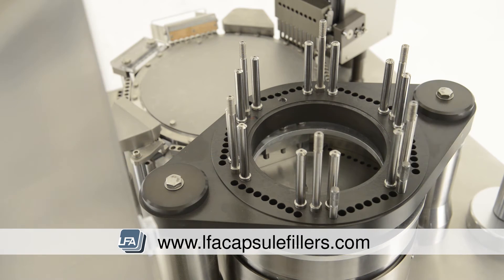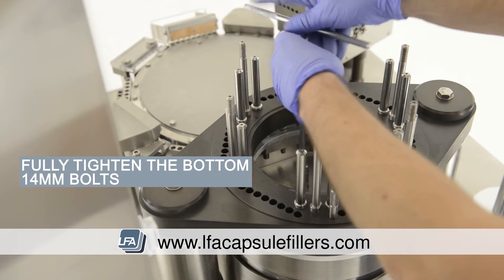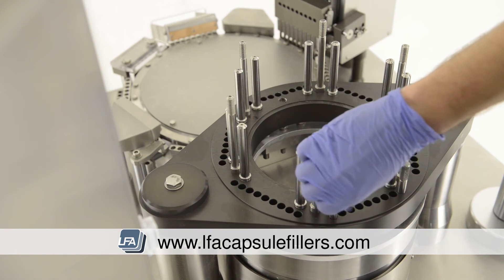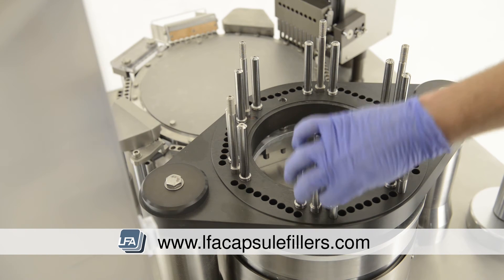Now use the special tool that came with your FACF and tighten the bottom section. As always, do this in small increments and equally. Check the alignment tools periodically whilst doing this to ensure they're still moving freely. If you find the alignment tools are catching and rubbing, simply loosen the bolts at the bottom section, adjust and redo.